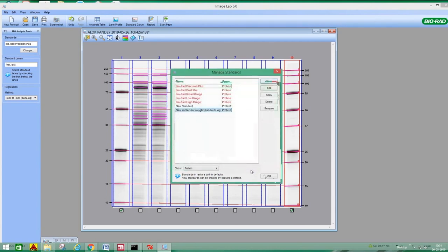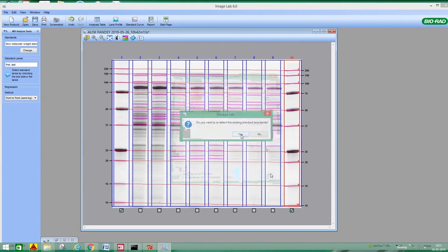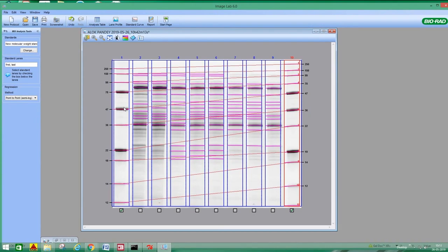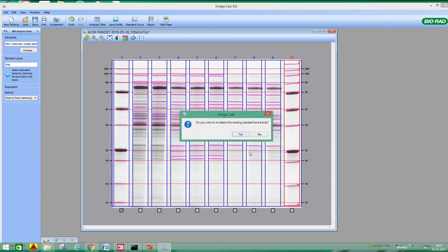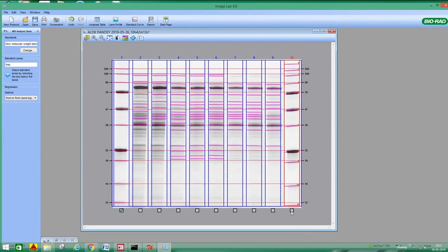After giving the molecular weight, you just click OK. And you select OK. It is asking if you want to apply. Yes, I want to apply. So see, here this is the molecular weight we have selected. See here, new molecular weight marker XXY. So here you can see what we have given is coming as it is.